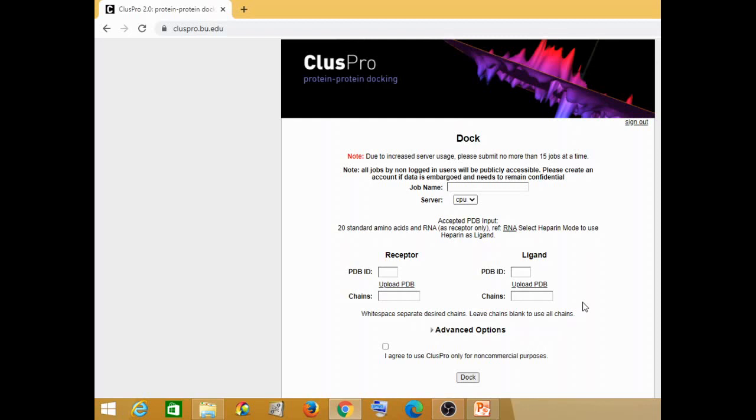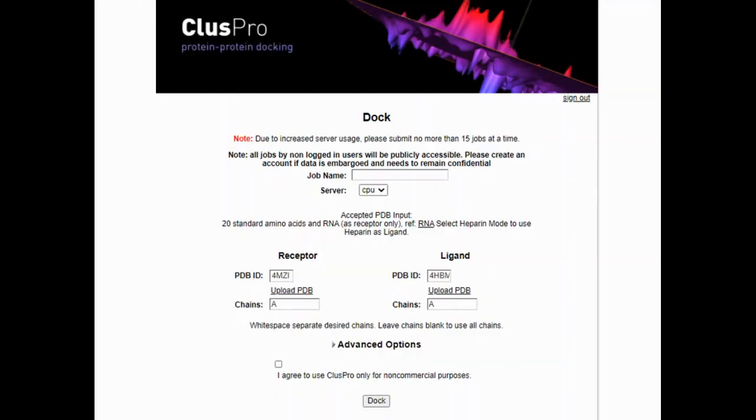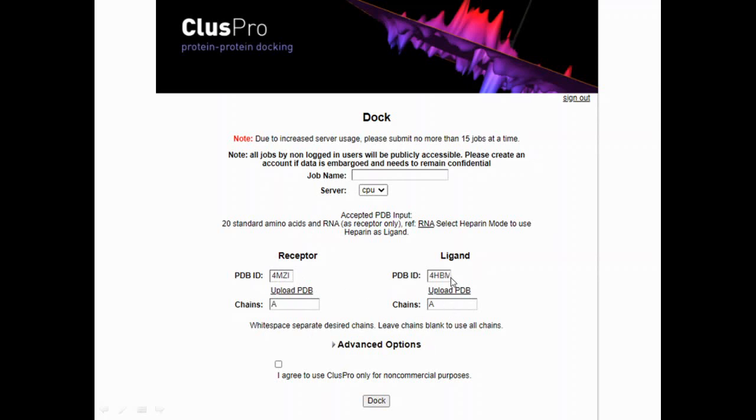I'll just switch to the screenshots now. The example which I have taken here is of P53 and MDM2. 4MZi is your P53 protein and 4HbM is your MDM2 protein. Both of these PDBs I have taken from RCSB PDB, and once you go into both of these, you will see that both of them have one single chain which is the A chain. We are trying to do a docking of the A chain of 4MZi with the A chain of 4HbM. You can also incorporate some job name of your choice. Then you click on 'I agree to use ClusPro for non-commercial purposes' and then click on dock.